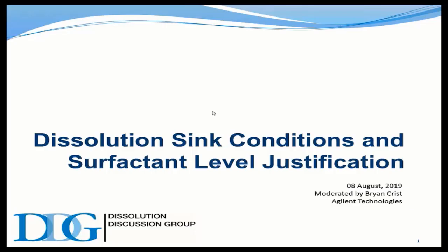And we're going to talk today about dissolution sink conditions. To handle sink, we'll go through this, and then how, one of the most common ways we see in dissolution methods is to possibly during development add some type of surfactant. Sometimes we increase volume, but surfactants are very common in dissolution testing, in fact recommended by FDA, to allow us to use standardized dissolution volumes and equipment and so forth. So we'll talk about these as we go through.